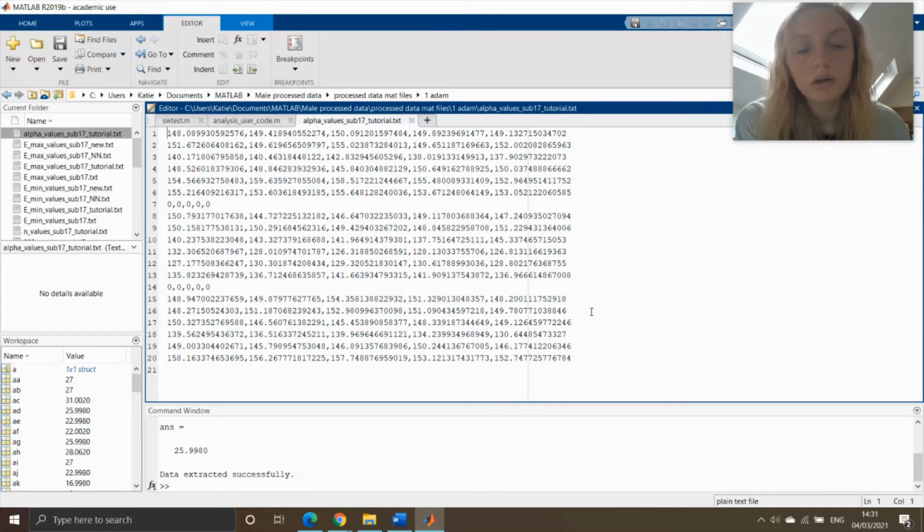The structure of this code may change a little bit based on your protocol. So if you did, say, 10, 30, 50 minutes, 2 hours, 4 hours, then you might need to add in some extra zeros to separate there, and you might need to mess with the structure of that matrix to be able to extract that data. But that's bare bones, just changing the odd line here and there. That should be easy to edit for you.